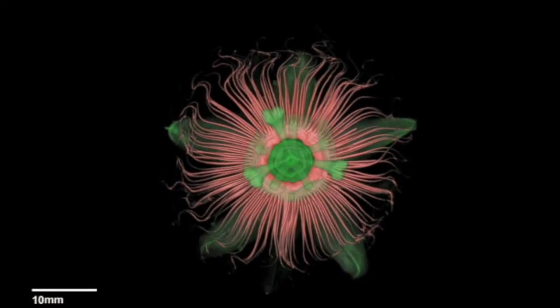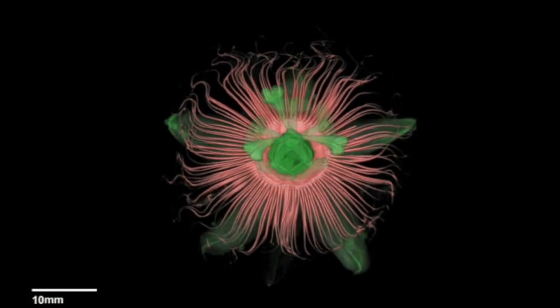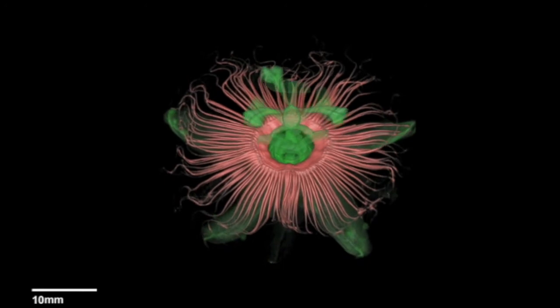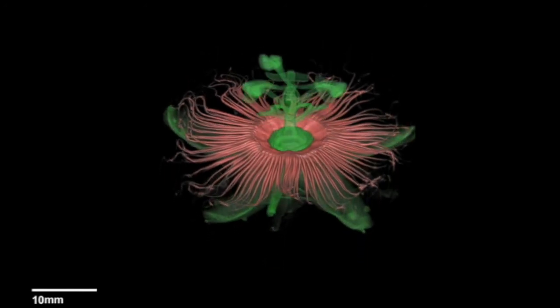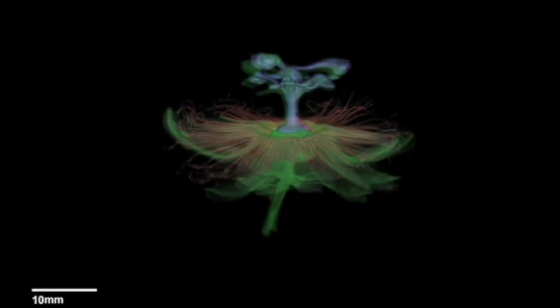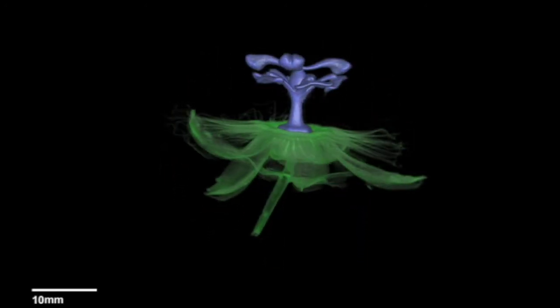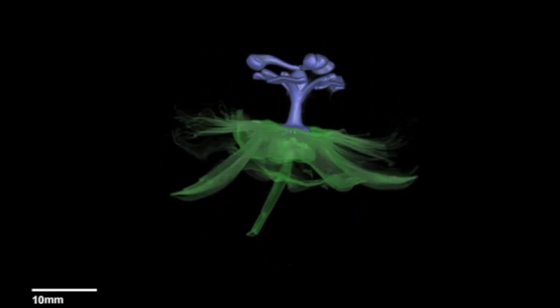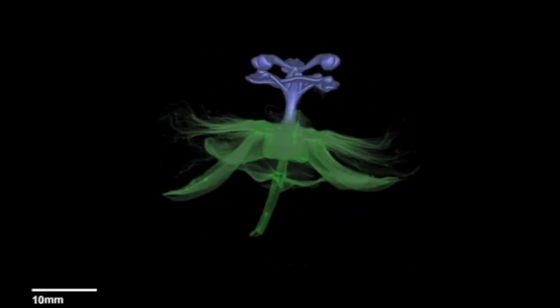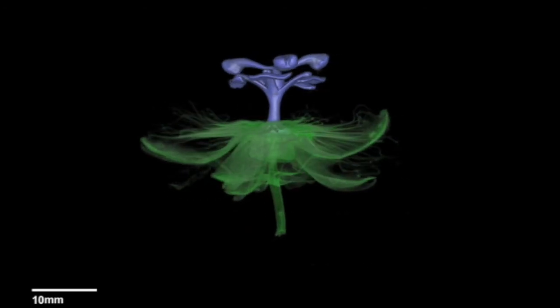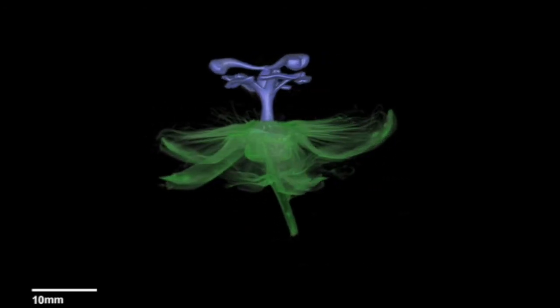This technique is extremely useful to obtain detailed 3D descriptions of plant structures, contributing to the studies of plant development and evolution.